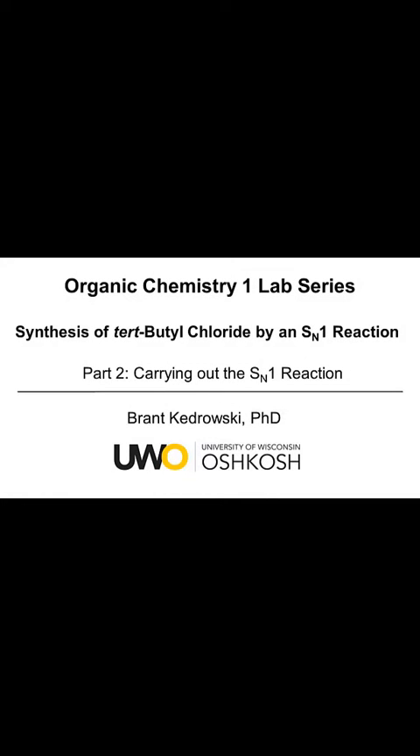Hello everyone, my name is Brant Kudrowski and this organic chemistry lab video covers the synthesis of tert-butyl chloride by an SN1 reaction. This is part two, carrying out the SN1 reaction.